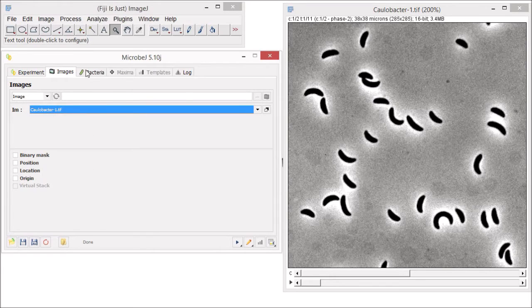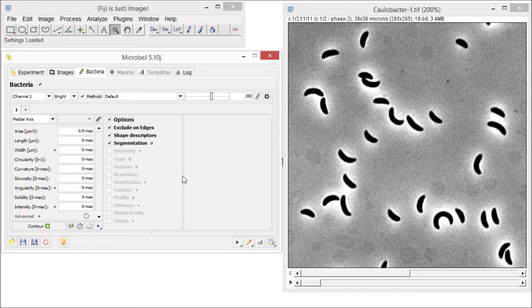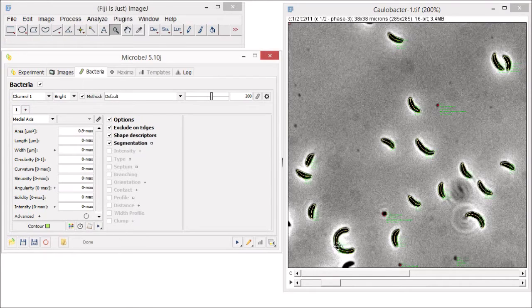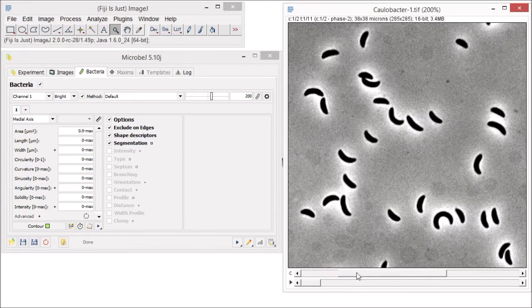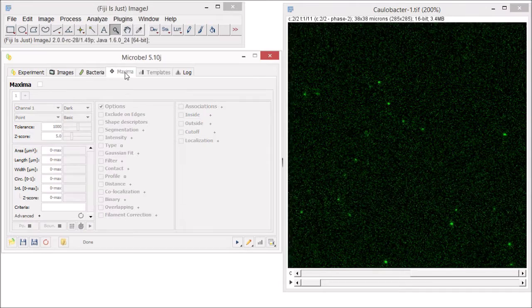We will now load our saved optimized settings for bacteria detection that we created earlier by dragging it onto the MicrobeJ status bar, and click the test button to detect the bacteria. Use the channel slider to move to the fluorescent images in the hyperstack. Now let's explore the features of the maxima tab.